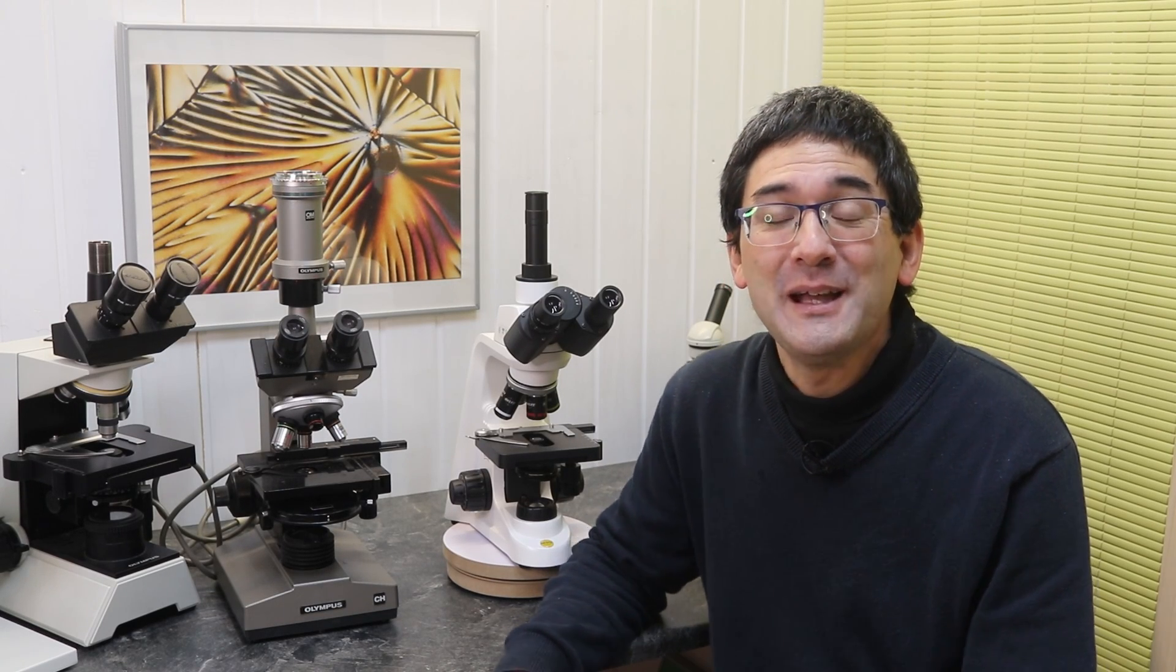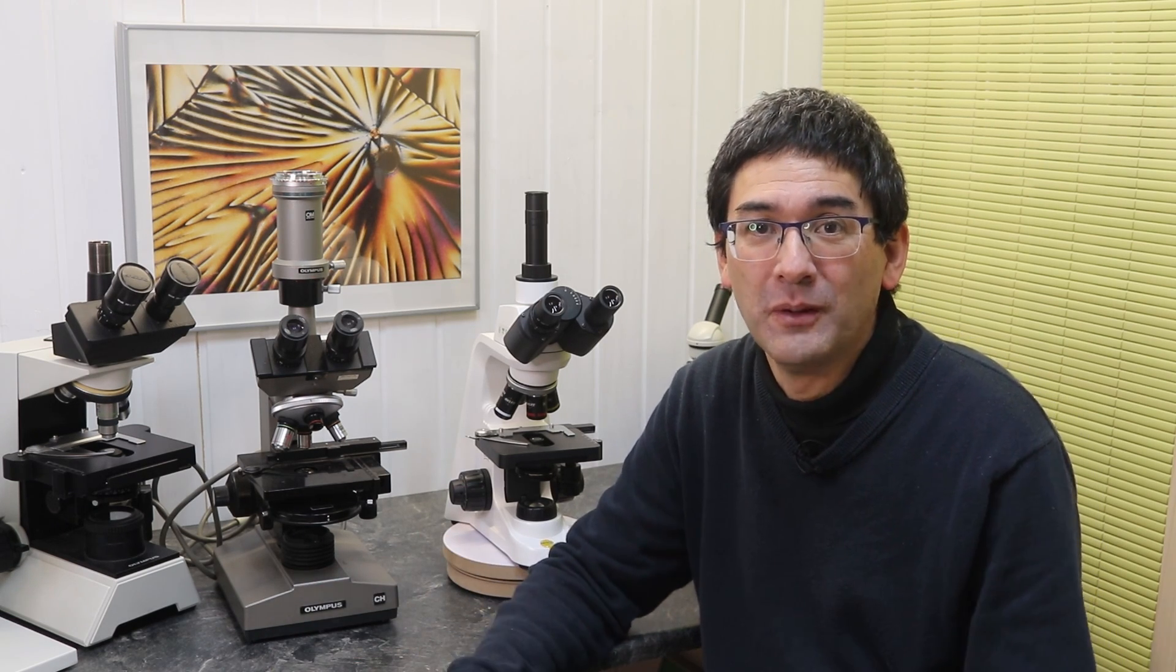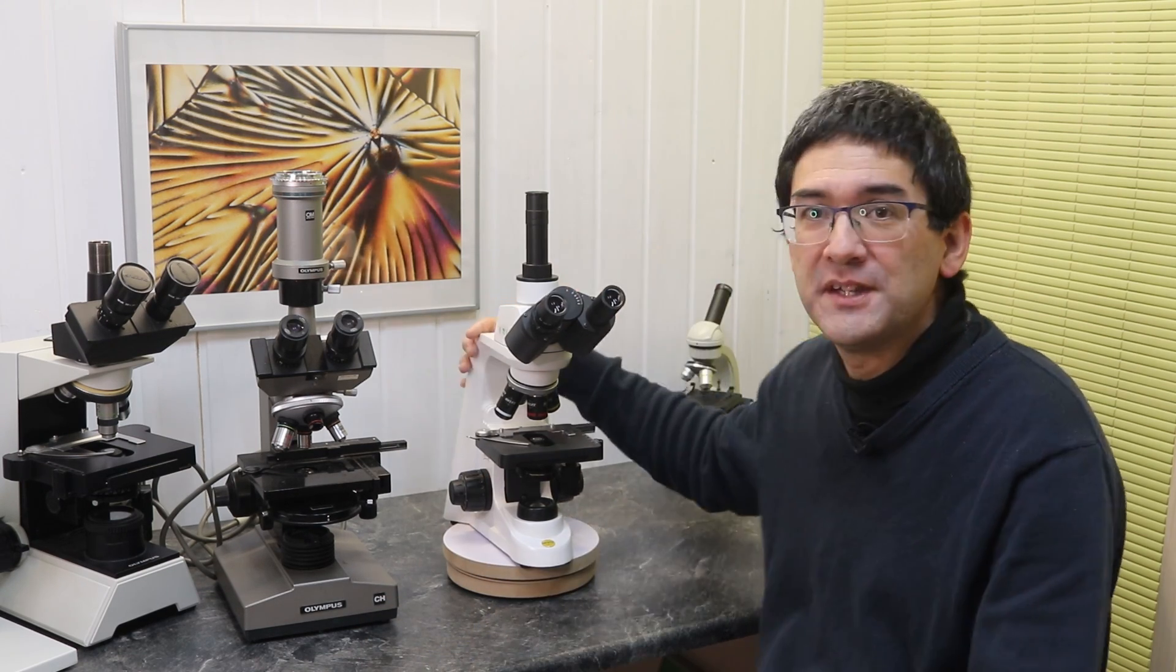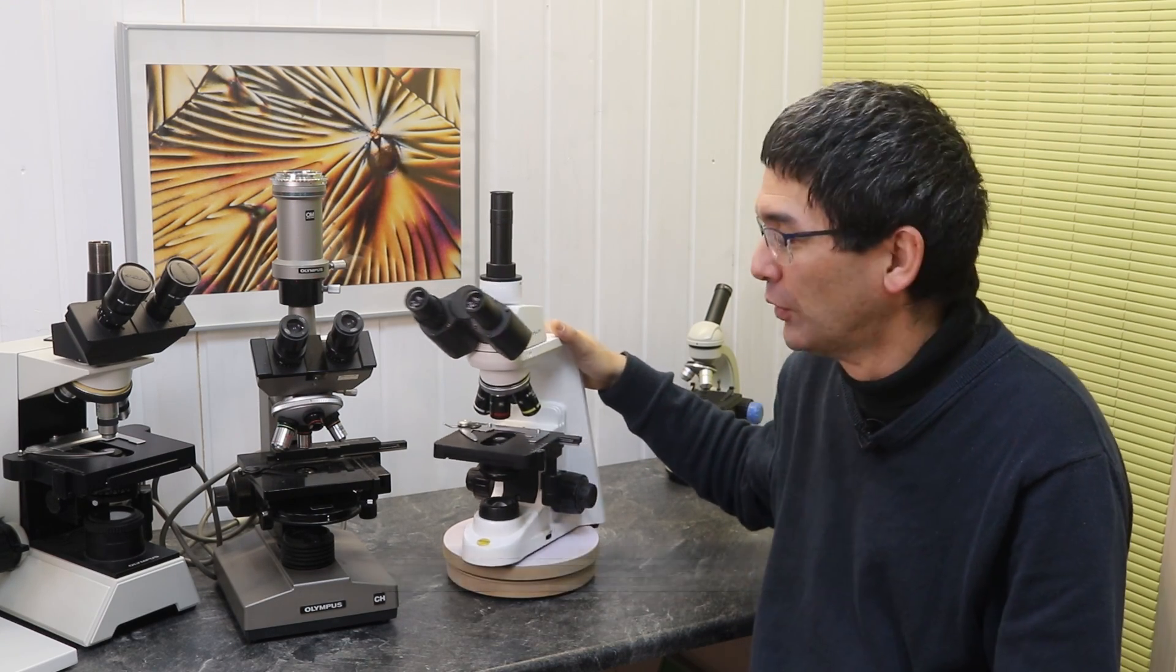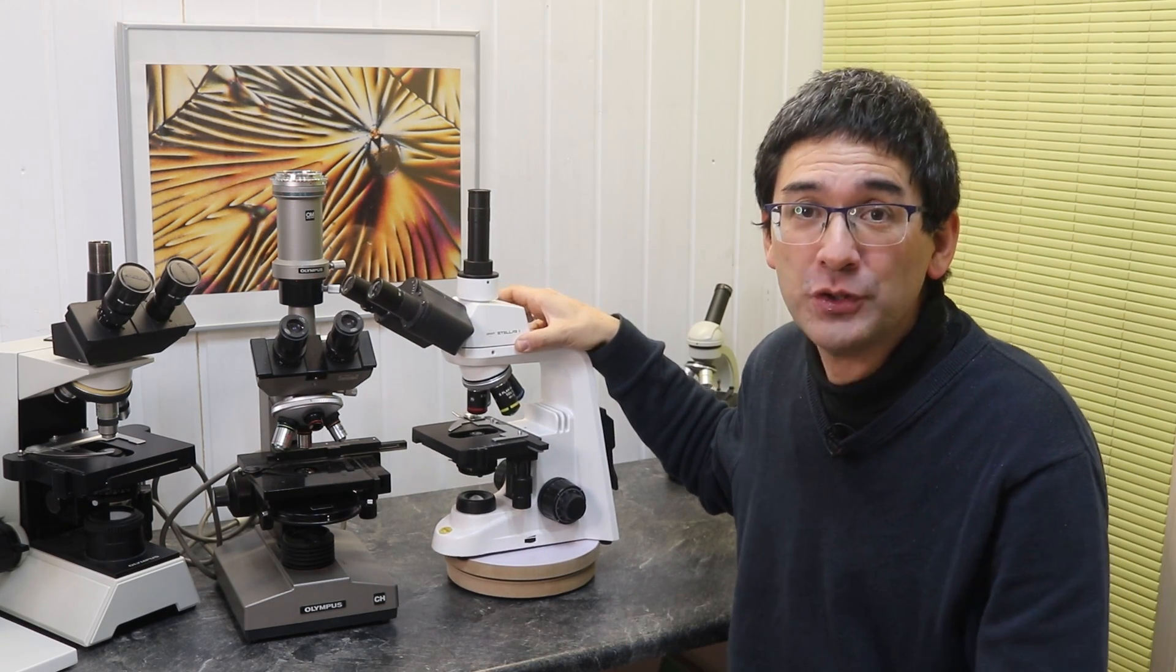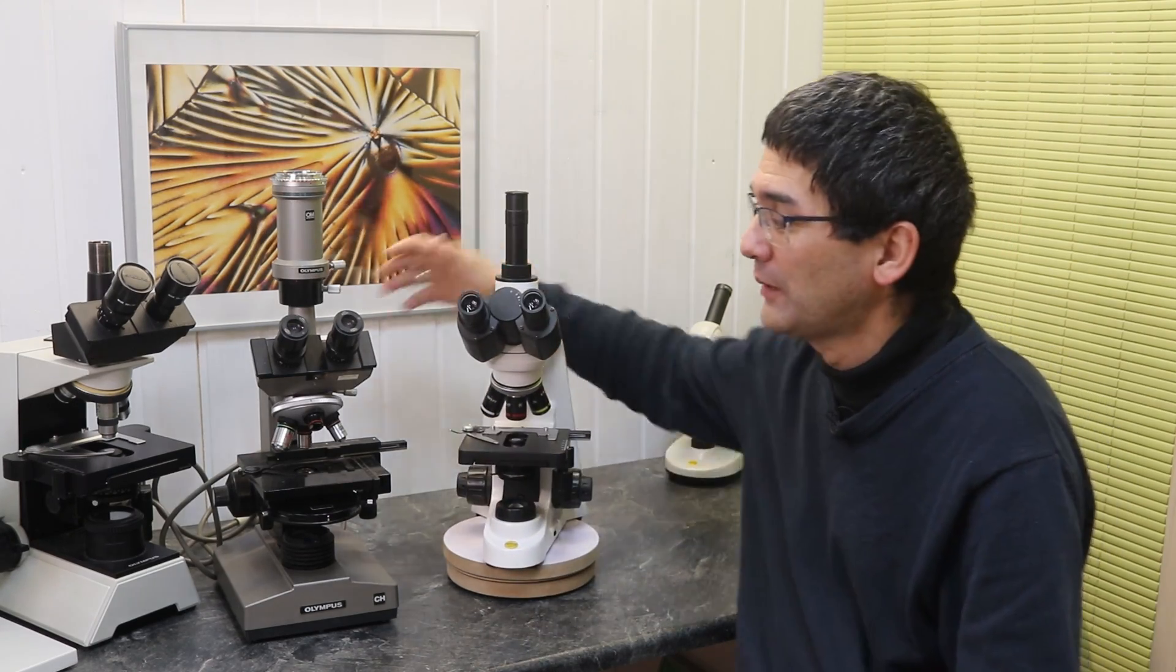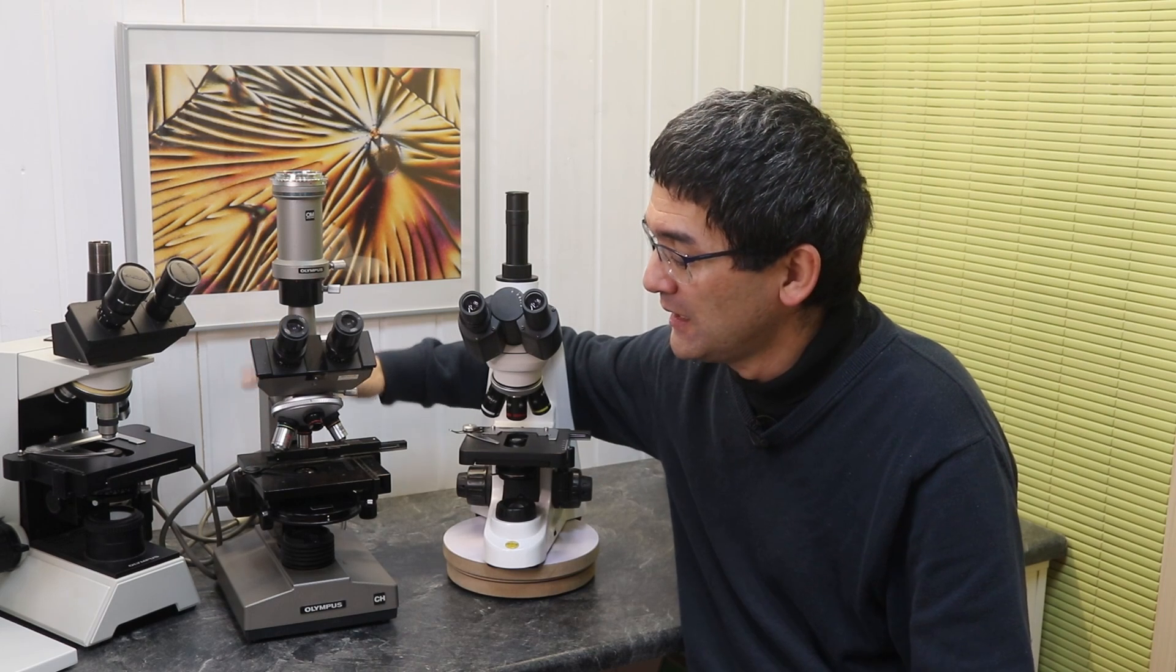Thank you for the question. I think this is not an easy answer, so I'll talk about the pros and the cons of either option. In short, should you buy yourself a new microscope like this Swift Stellar one? It comes in two different flavors - the pro version has infinity optics and the standard version has the traditional 160 millimeter system.